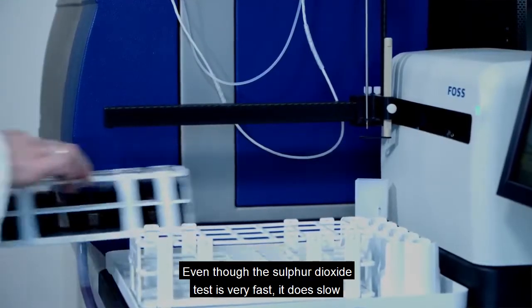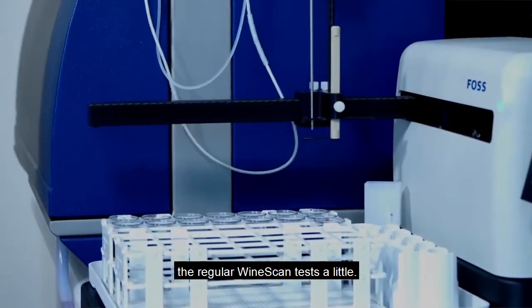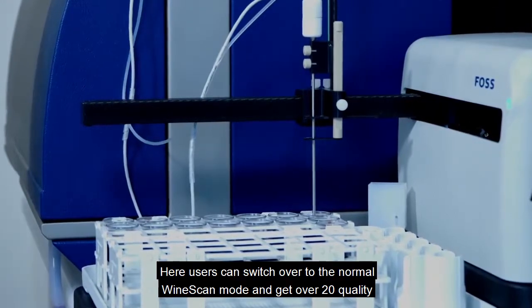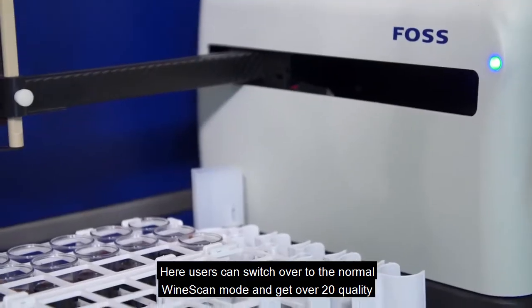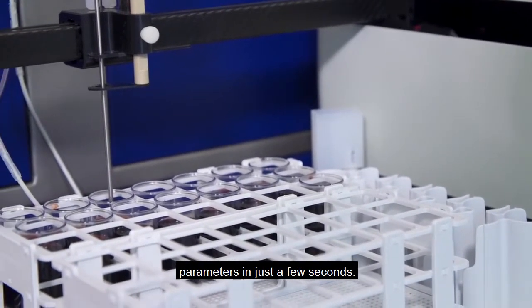Even though the sulphur dioxide test is very fast, it does slow the regular Winescan tests a little. Users can switch over to the normal Winescan mode and get over 20 quality parameters in just a few seconds.